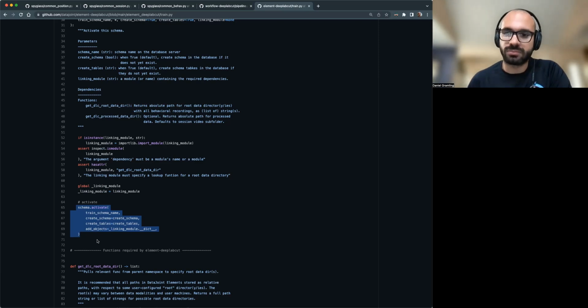There are other lab pipelines that do one or the other: either rely on ours in order to get the updates, the maintenance, and check the change log, or fork it to keep it in a static state and either make changes or manually pull from upstream whenever we push updates. The general policy is not to push backwards incompatible updates without releasing some form of conversion script that would help you get from one point to the next. Cool. Yeah.